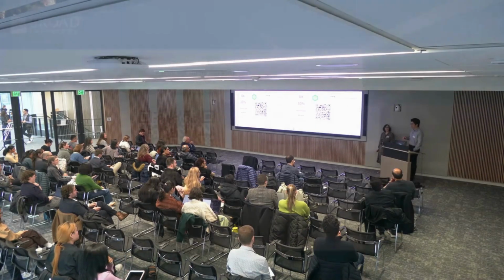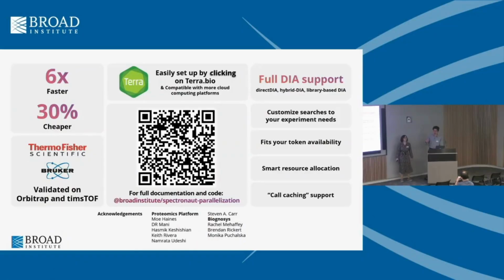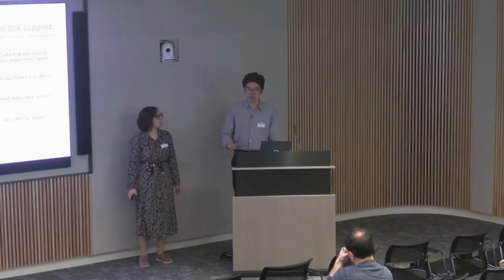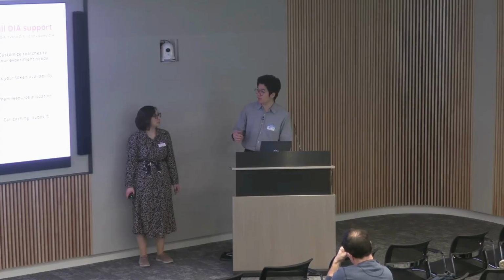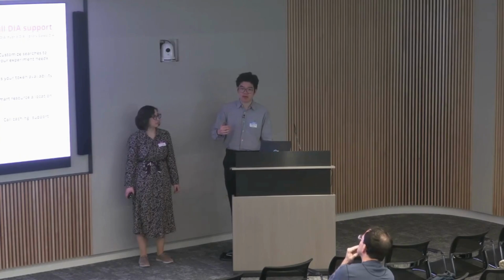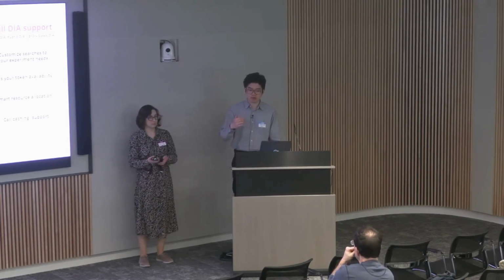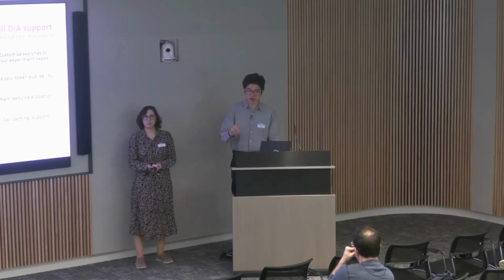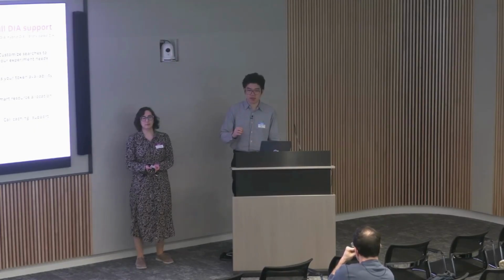So usually when we're talking about parallelization, we're doing 1 file per VM, but each VM takes 1 token. So for users that have limited token availability, we have flexible binning methods where you can set the number of batches of files that you are parallelizing very flexibly.